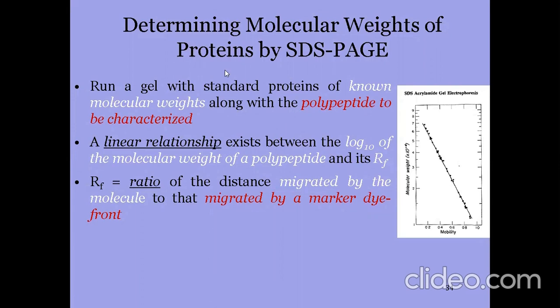If we have a gel like this, and these will be the wells to load our sample, we load our sample in these wells, and with the sample we also add a loading dye.